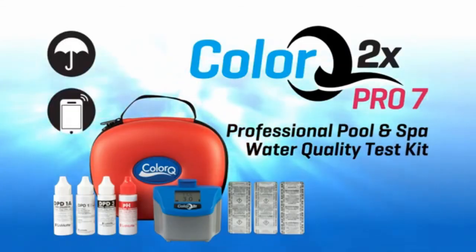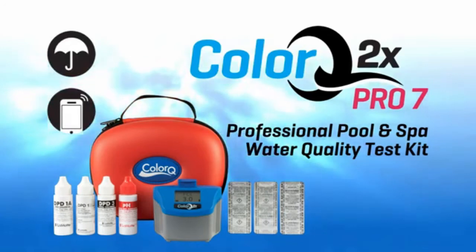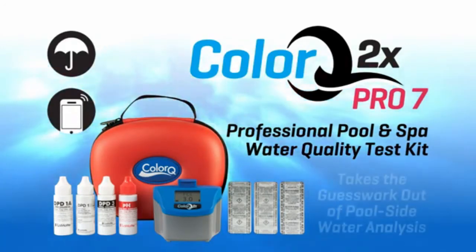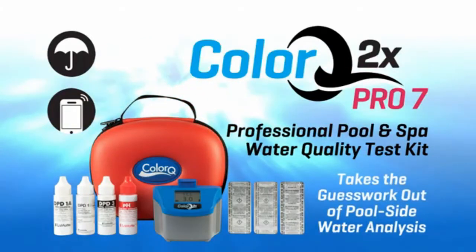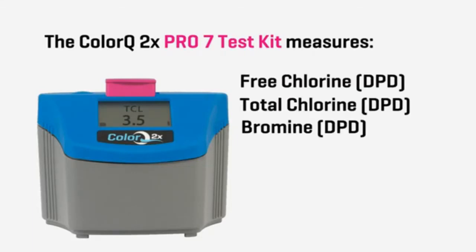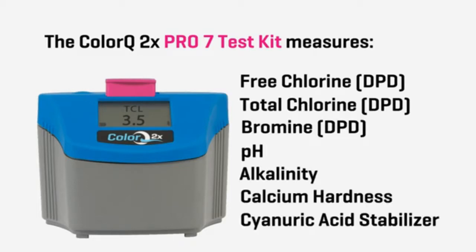The waterproof Bluetooth ColorQ 2X Pro 7 professional pool and spa water quality test kit takes the guesswork out of poolside water analysis. The ColorQ 2X Pro 7 test kit measures free chlorine, total chlorine, bromine, pH, alkalinity, calcium hardness, and cyanuric acid.